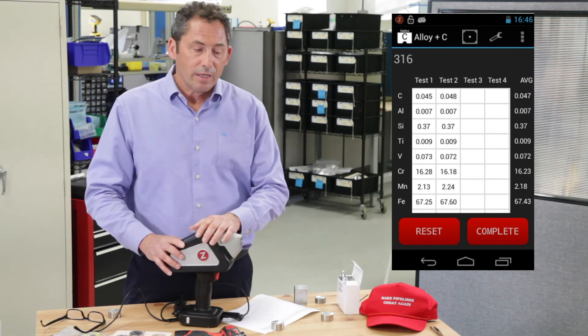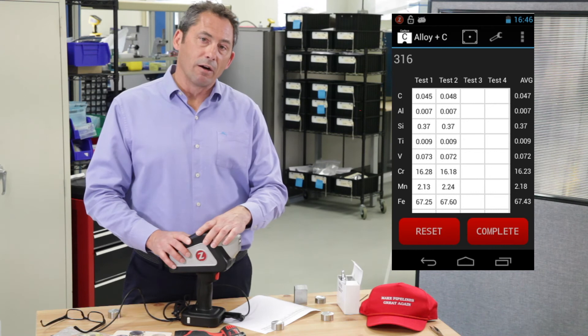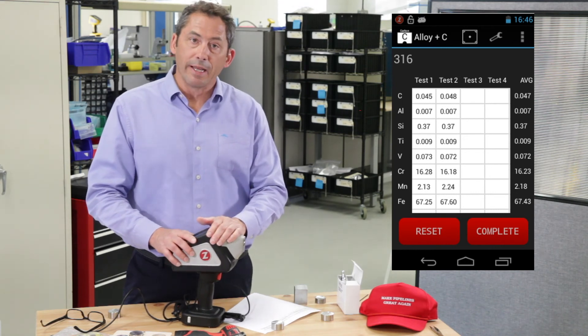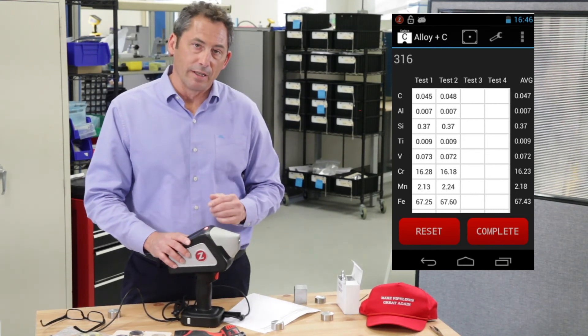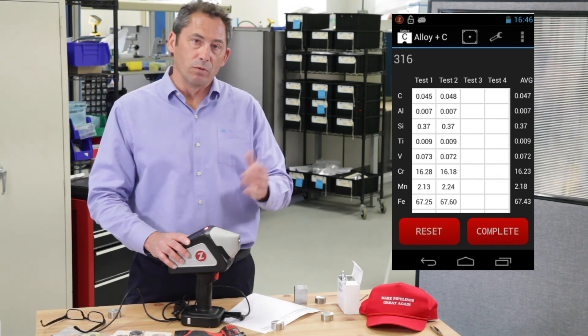Our customers are doing their PMI for carbon in a fraction of the time it used to take them with a spark OES with this nice little handheld. This just gets them about another factor of two in throughput.